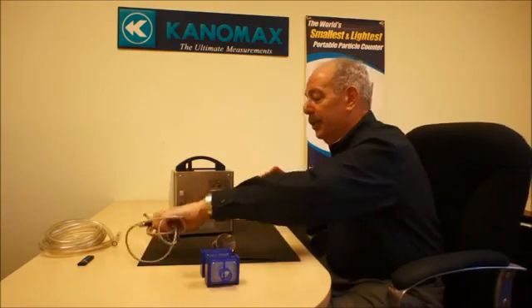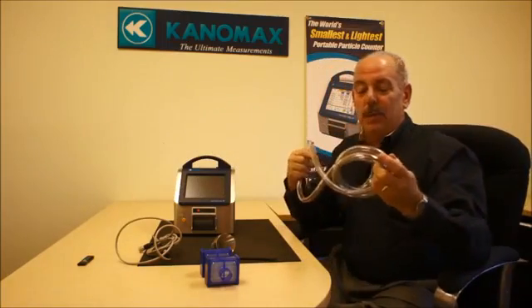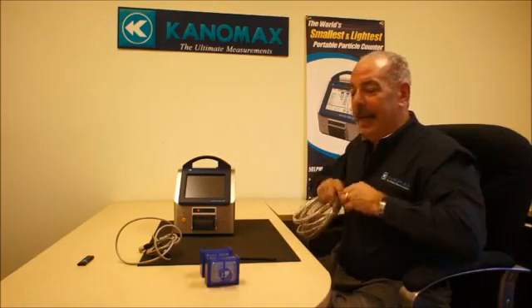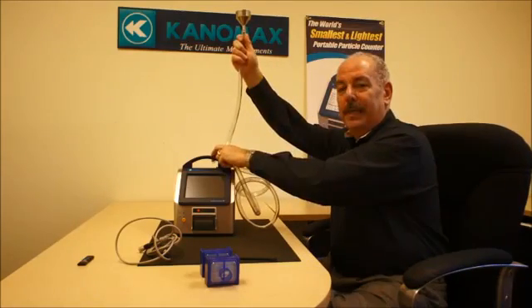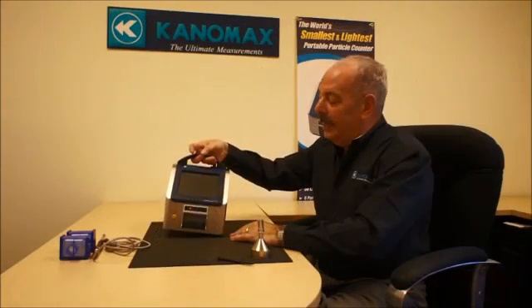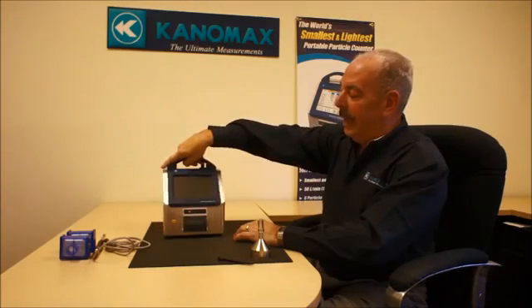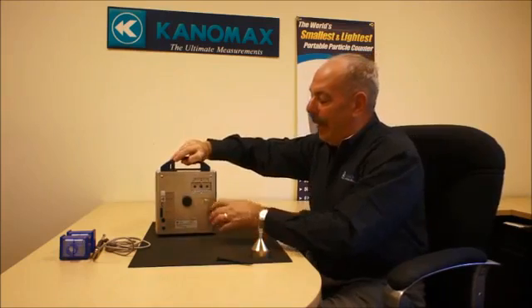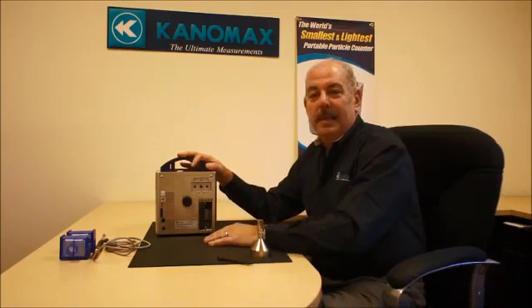So you can do additional capable measurements from the same instrument. The unit comes with a two-meter hose so you can connect the isokinetic probe to the hose and take the measurement up to the point where you need to measure. The 3910, which is represented here, is very lightweight and small, easy to operate. The unit itself is all stainless steel enclosure and has the ability to operate on lithium-ion batteries, located in this position, as well as an AC adapter.